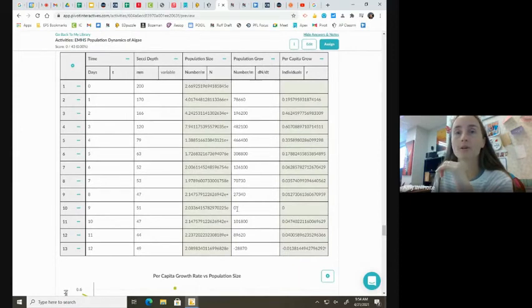And by the way, this shouldn't be 0. I don't know why it's 0. It should have a number in there too. But I found my carrying capacity, and I found what the growth rate was when it hit carrying capacity. So from there to there, and I just used that for my maximum growth rate. Is that the right way to do it? Probably not, but I'm not an ecologist, and what you're supposed to do is figure out the maximum growth rate it can do.